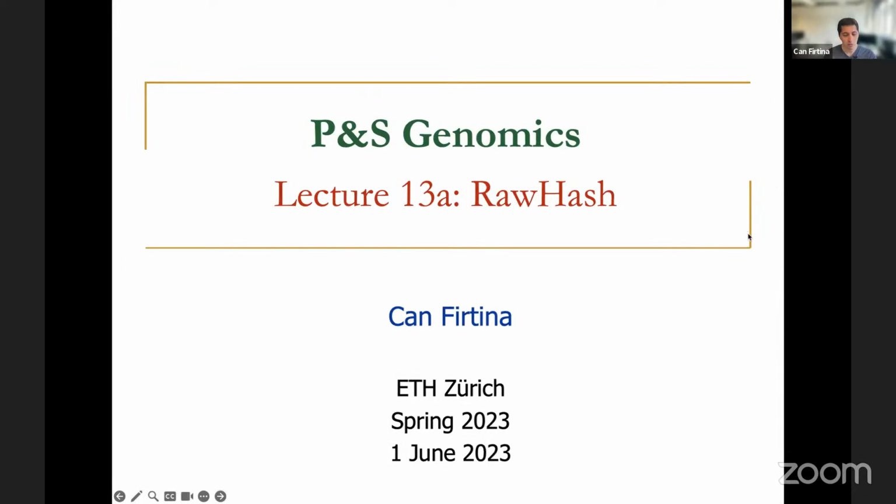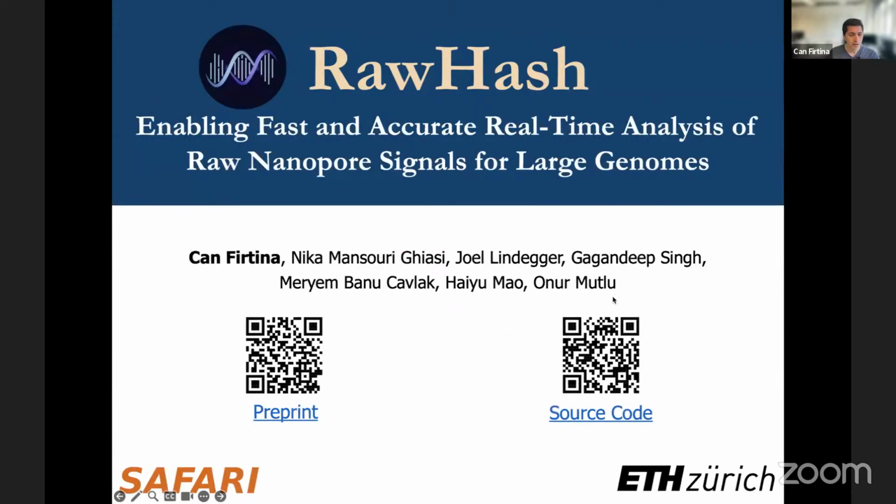But mainly in both of these lectures, we're going to be focusing on the nanopore raw signals and nanopore sequencing. So that's why I'll also give a very quick background on nanopore sequencing during the first lecture. So with that, let me start. All right, as I said, I'll present RawHash, enabling fast and accurate real-time analysis of raw nanopore signals for large genomes. You can find the preprint of our work using this QR code, and you can also find the source code using this QR code as well, if you're interested.